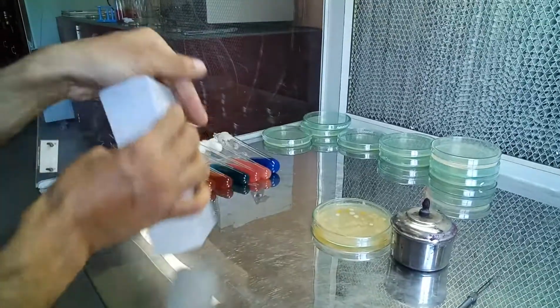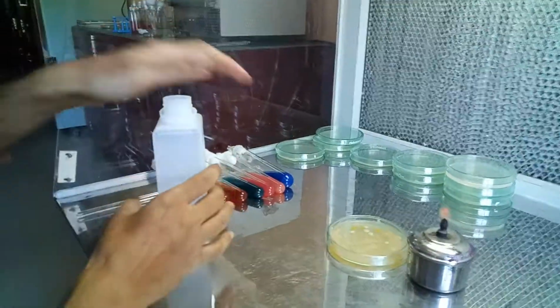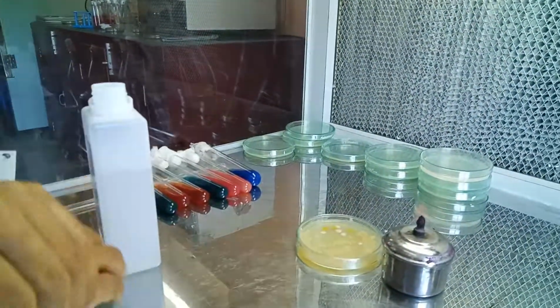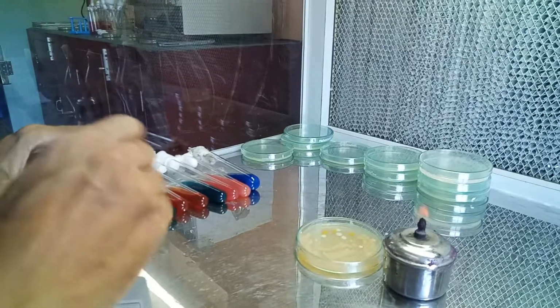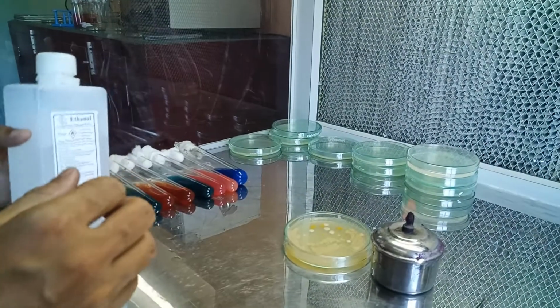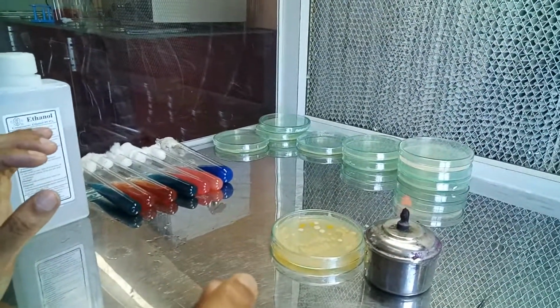Hello everyone. Today we'll be performing citrate utilization test. So citrate utilization test is carried out to check whether a bacterial culture or a bacterial cell or a bacterial colony is capable of utilizing citrate as a source of carbon. So there are certain bacterial cells which are capable of utilizing citrate as the sole source of carbon.